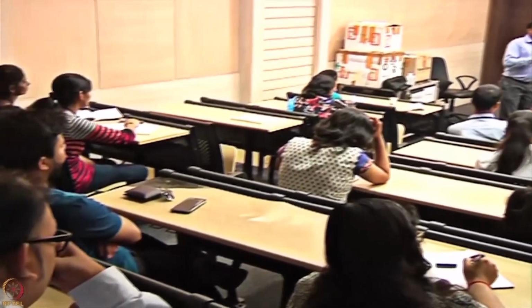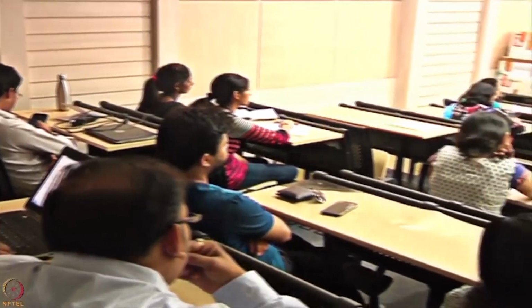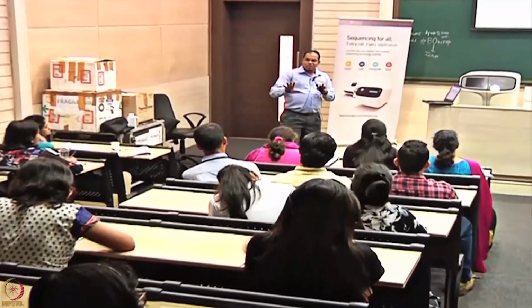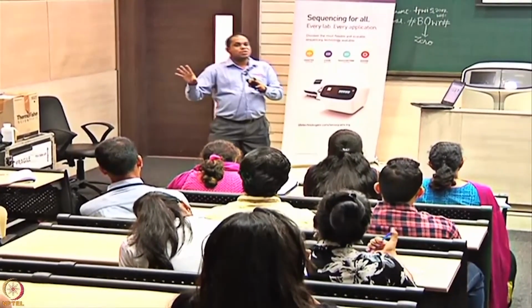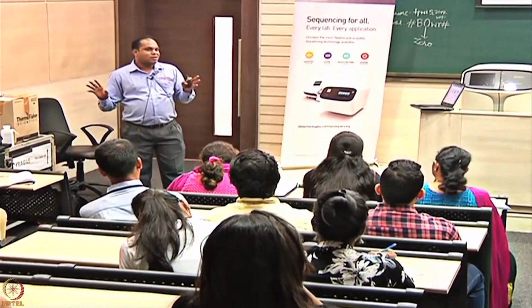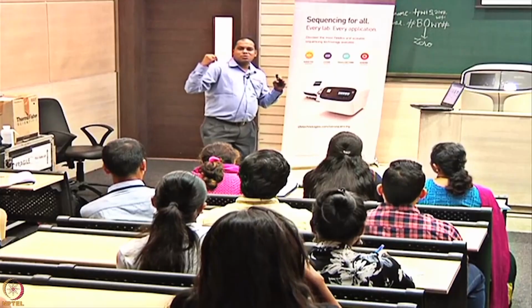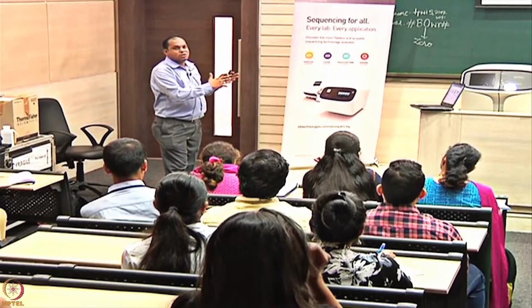Okay. With that, it assigns databases from dbSNP, COSMIC, OMIM, DGV, where it correlates with all the information that is related to your genetic disorders, cancer, and various other genes that are oriented to it, genes, transcripts that are related to it. So you must have heard about NCBI, right? Yeah. NCBI is a database where you have lots of information stored, whether it is gene, OMIM, dbSNP. So every information from there is correlated over here in Ion Reporter. Okay.